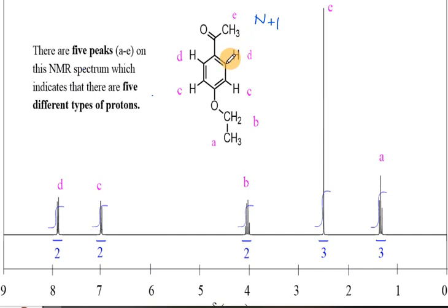Let's take proton D here. This proton D has a nucleus C on the adjacent carbon. So with this compound, the D and the D here, this one and this one, all will display one signal. The nuclei on the adjacent carbon of the carbon that holds the D are the C and the C here. So since this D and D will all display one signal, the number of hydrogens on the adjacent carbon is just this one and this one.